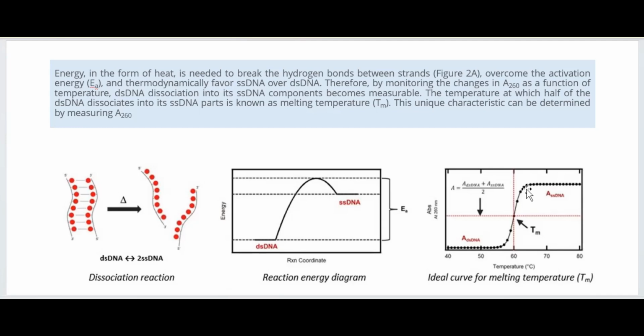Also, it will reflect upon the size. Bigger the size of the DNA, more it will take to melt. That is another thing. Complexity of the DNA, that is another thing. And all this data has applications in classification and systematics of bacteria or organisms.